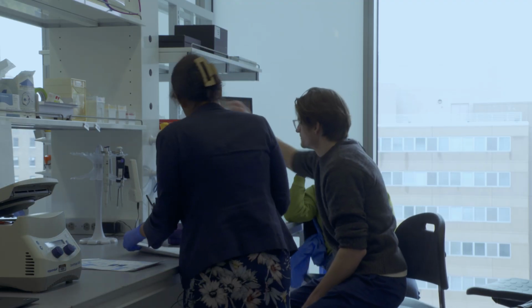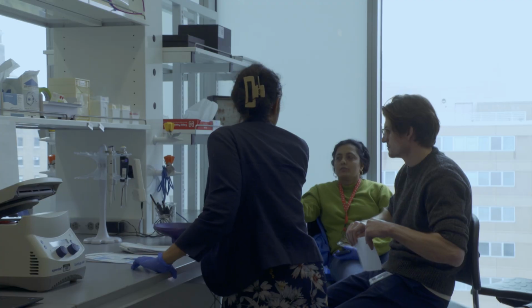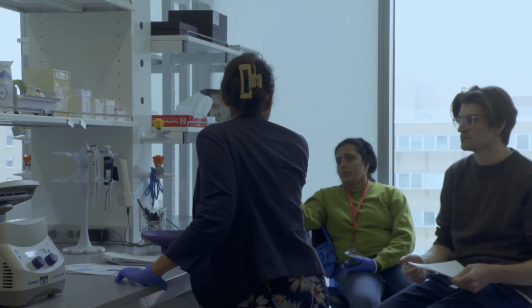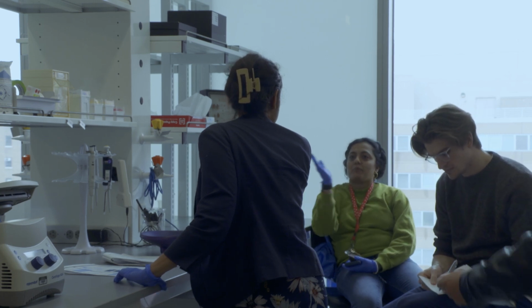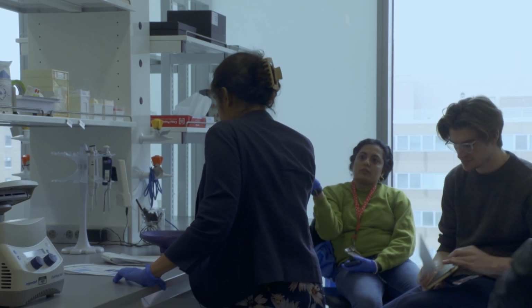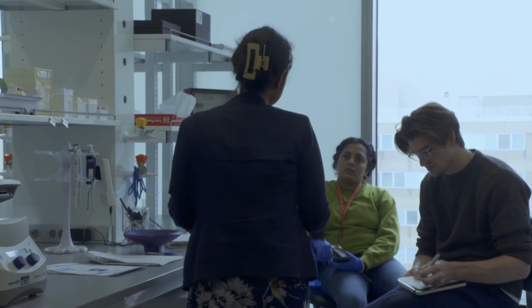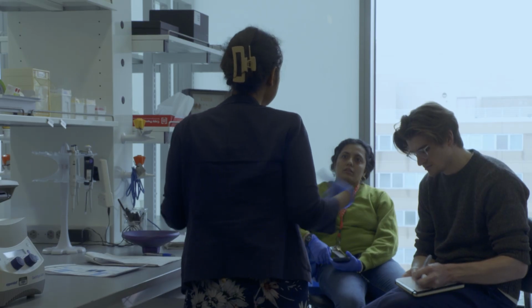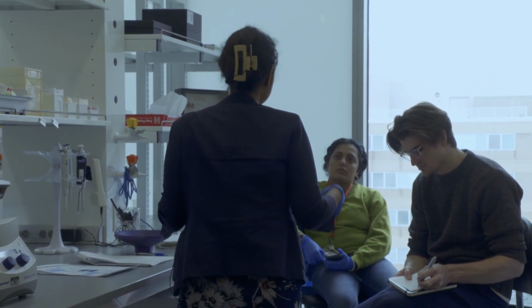Yeah. So I have one more question. Sure. When you are pooling samples together, you're barcoding them as well? Yeah, if you don't barcode, then you can't. Exactly, that's what I wanted to know: when do you barcode? The first step is end repair. The next step would be barcoding, and then the third step is addition of the protein helicase adapter.